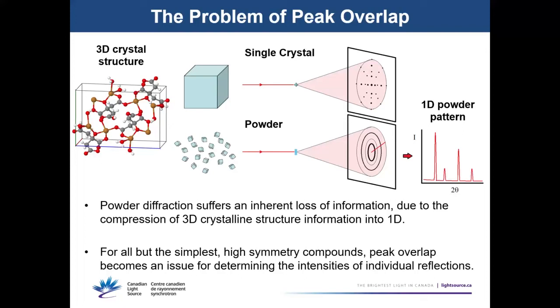This makes powder diffraction a more straightforward experiment than single crystal diffraction in some ways, but maximizing the information is a lot more challenging.